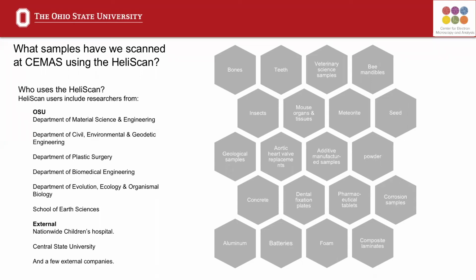So that was a very brief overview of the HeliScan MicroCT. Now we're going to move on to the fun part of the talk, which is the case studies. To start with, I wanted to share this graph with you, which shows the range of different samples that we've imaged here at CEMAS.